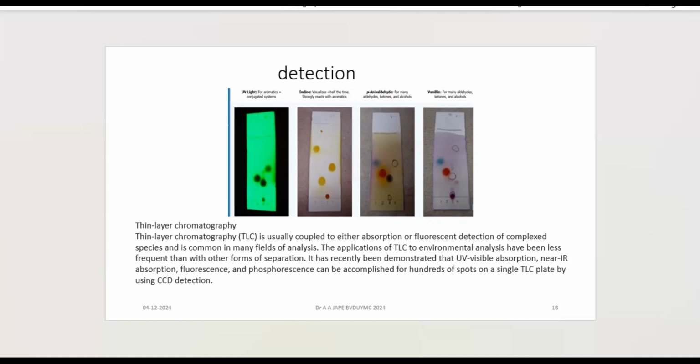They can be observed. And in case of analytes like the toxic molecules from fungi, right? They may give you fluorescence. Certain aromatic molecules, if they have their inherent fluorescence under UV, it can be very easily seen.